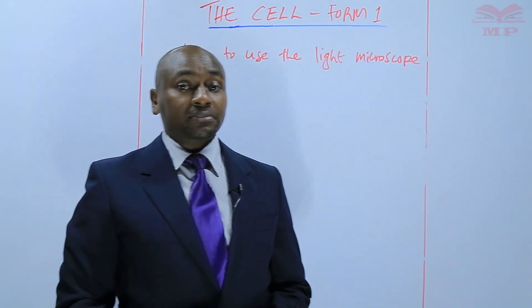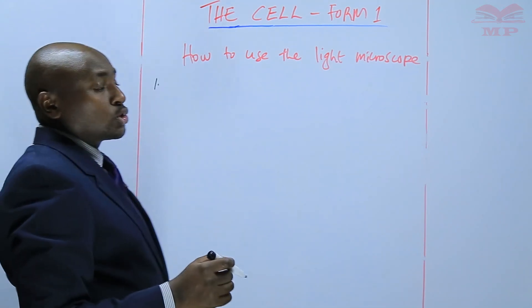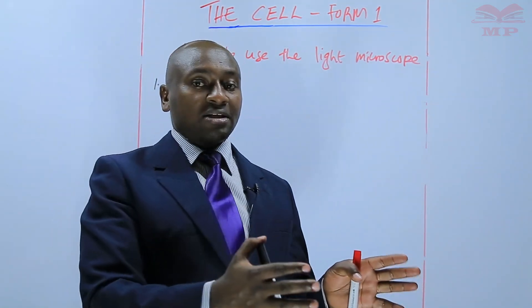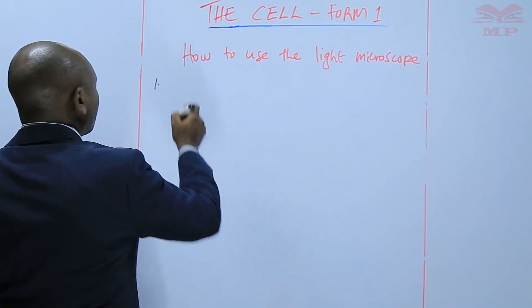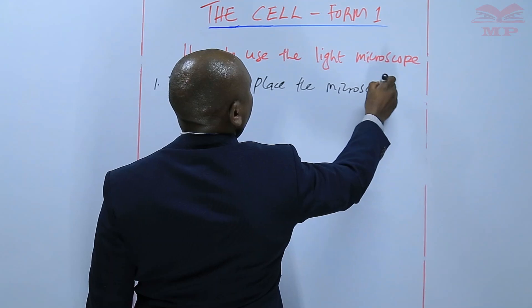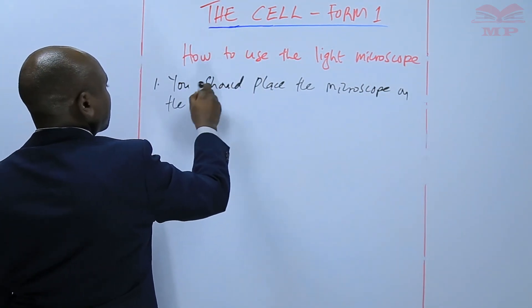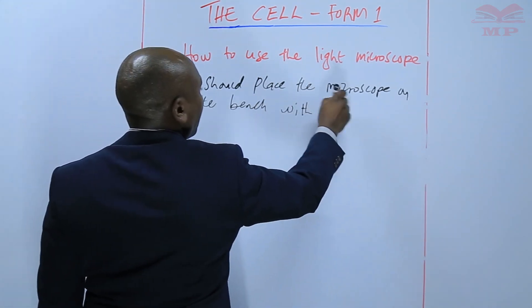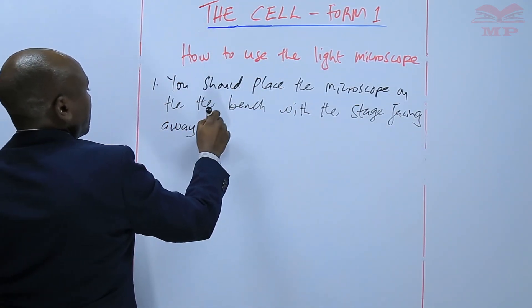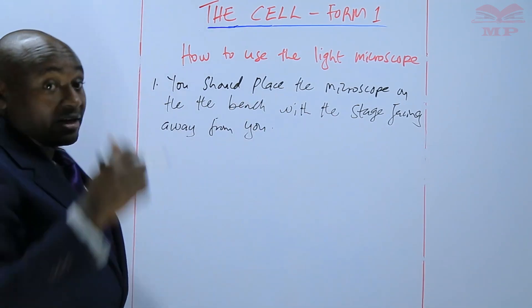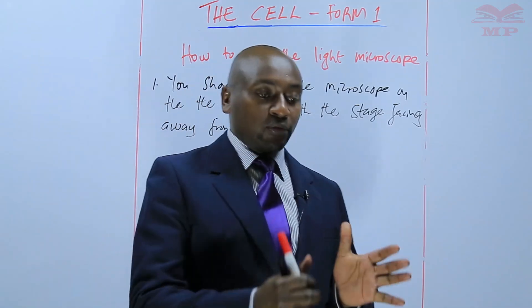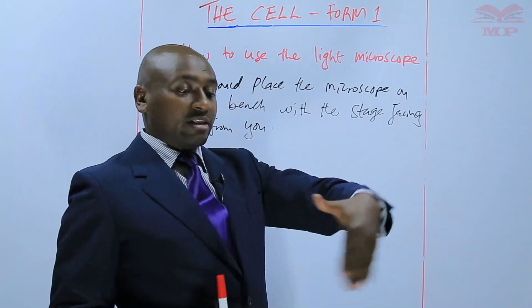The first thing is that the learner should place the microscope on the bench with the stage facing away from you. This is very important because when the stage is facing away from you, you do not obstruct the light. So you should be on the side that has the arm, and then on the other side the stage should be away.